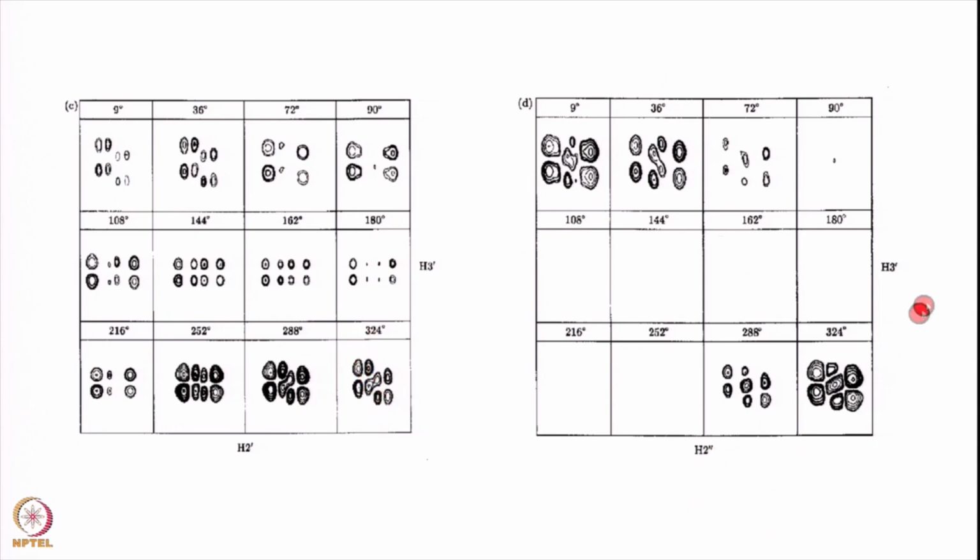And this is for the 2'' 3' peak. The 2'' 3' peak will not be present in the C2' endo geometry here, because the 2'' 3' coupling is 0 in this domain, in this whole area from here to here. That coupling is 0, therefore you will not see this. You will only see it for these, and this is for the COSY 45. You can combine this with the COSY 90 experiment. By and large it is better to simulate these than the COSY 90, because the number of components is relatively less. Therefore you can obtain better dispersion of the multiple components and calculate the structure.